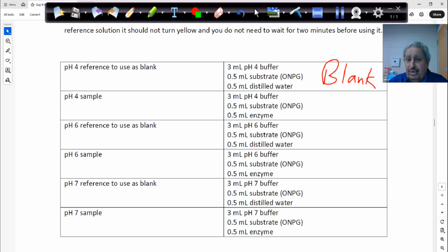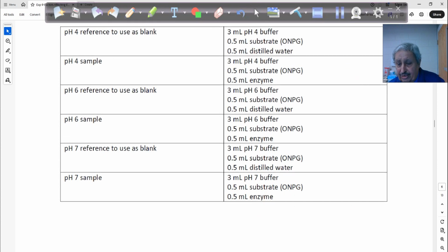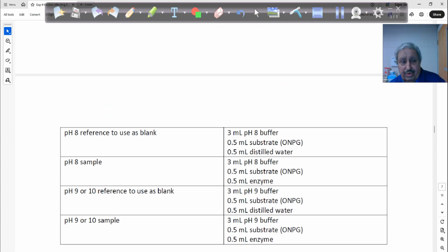Then this is test tube number 1, 2, 3, 4, and then this one here you need to have. So then you have to empty those after taking the absorbance. You have to take the value of the absorbance for all of these, and then whatever number 5, test tube number 5, correct? And then those are solutions. You record the absorbance. Every time you record your absorbance, you come here. So that's the second one, correct? And even here, following 8 and 9.